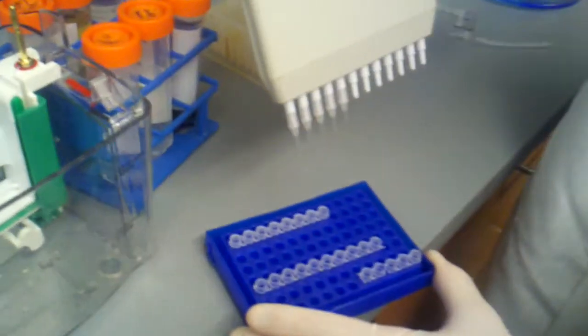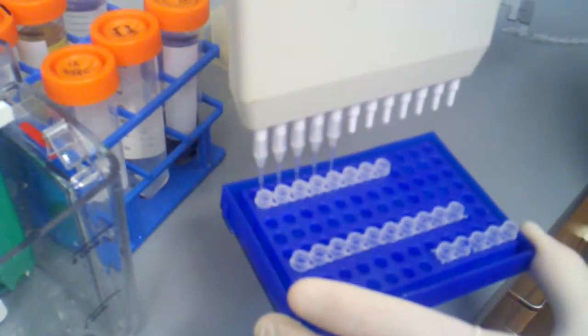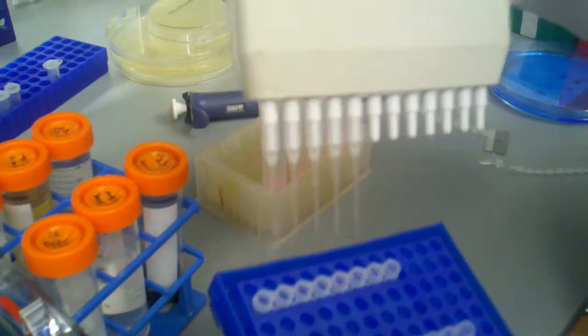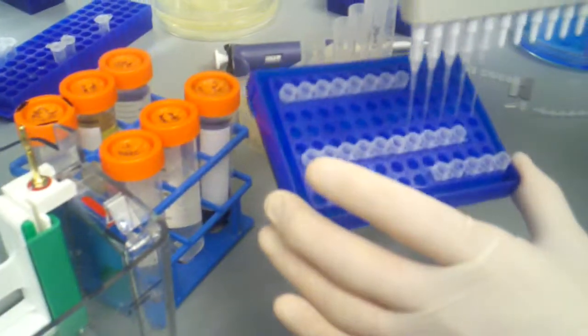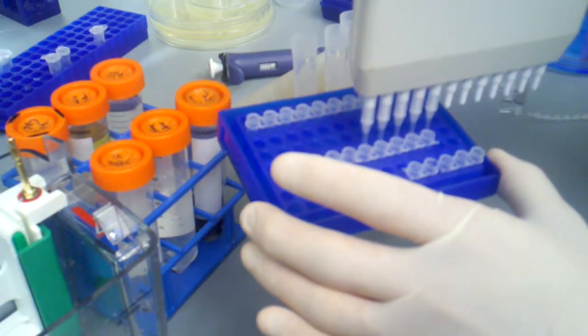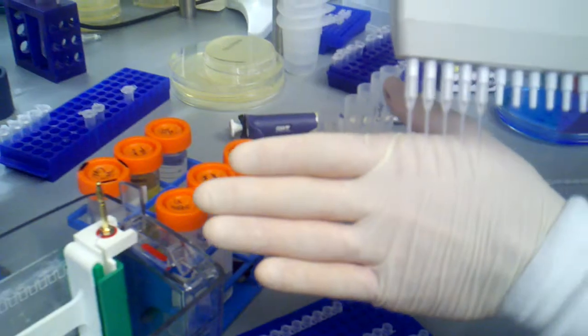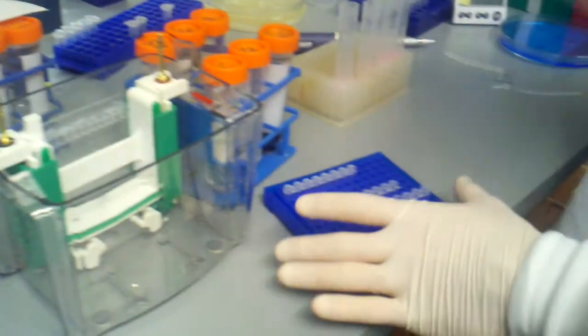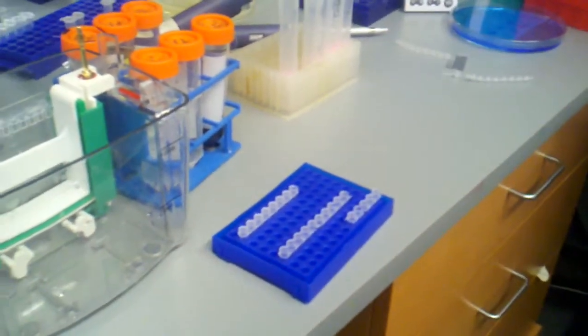So next we're doing 2 microliters. So, oops, looks like I missed. Oh, no, looks like I got it all. So 2 microliters. Hopefully you can see that shadow. And that's going to go into here. Make sure that my pipettes are empty. Okay, so you can eject that tip. And you always want to write down what your samples are, which I've already done over here in my own kind of hard to understand code. So I've done 1, we're good, 2.